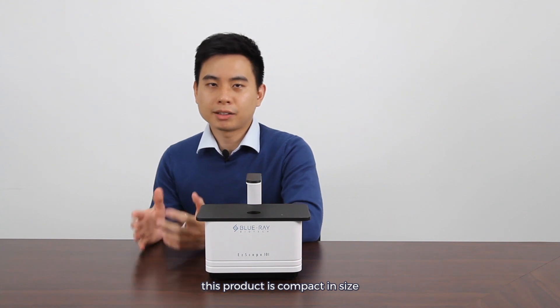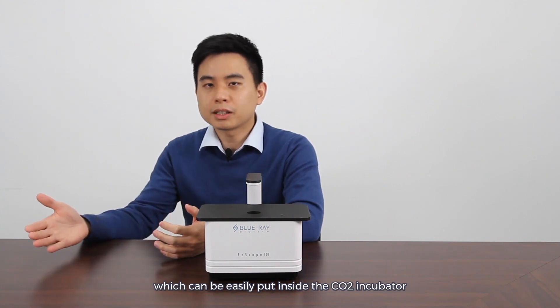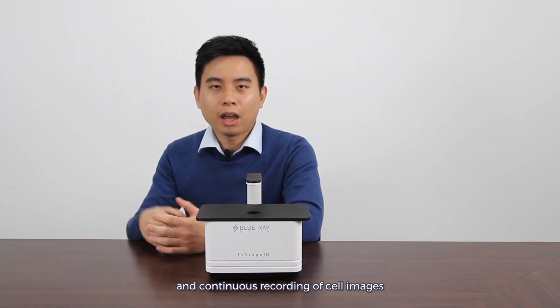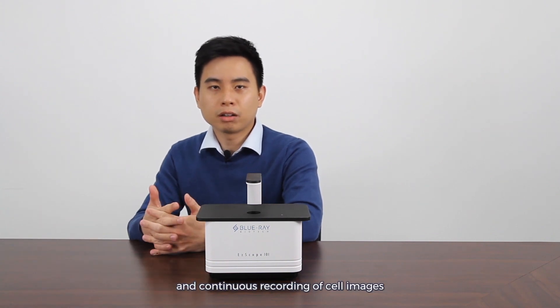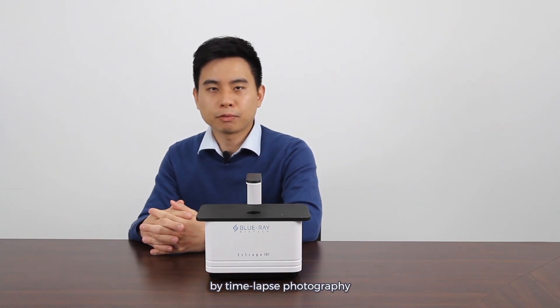This product is compact in size, which can be easily put inside the CO2 incubator and continuous recording of cell images by timelapse photography.